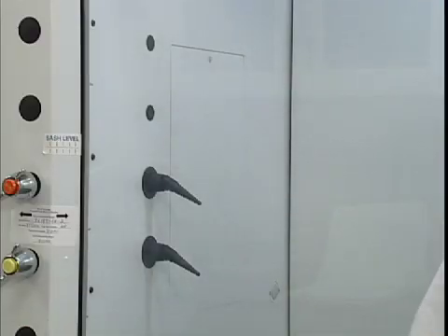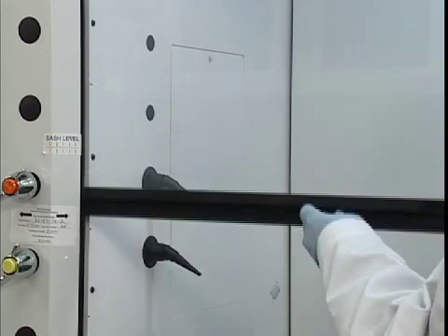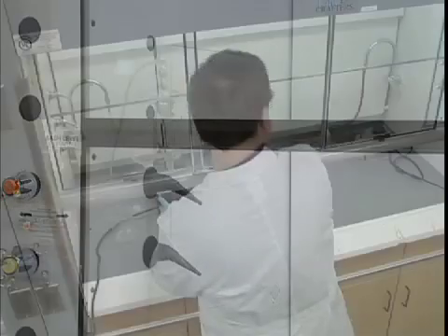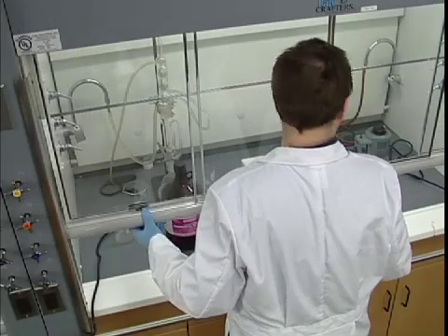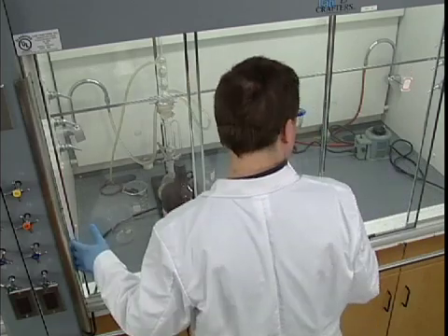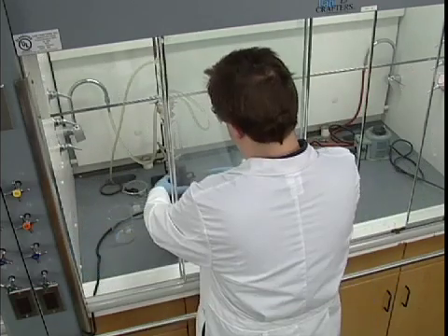Hoods also protect the operator from other physical threats. The sash provides protection from hazards like chemical splashes and sprays, as well as fires and minor explosions. Generally, you'll want to pull the sash down as far as possible while keeping it at a level that allows you to work comfortably.